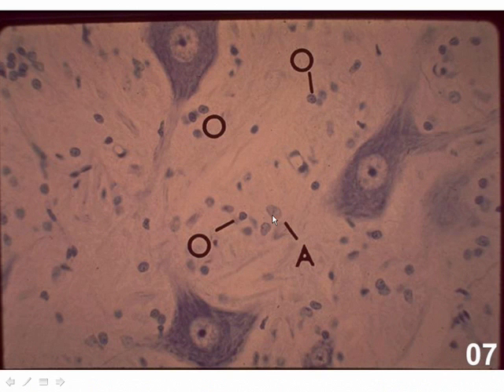These are nuclei of astrocytes, which is one of the types of glia. Compare that to a smaller, more heterochromatic, a bit more round nucleus. This is the nucleus of an oligodendrocyte, which myelinates axons in the central nervous system.